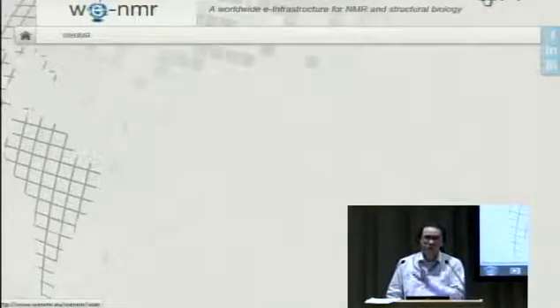To do the single sign-on, you must have registered with the VRC. That's mandatory. So you go here and log in.